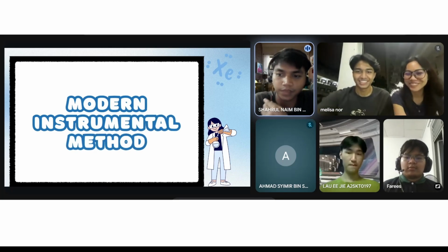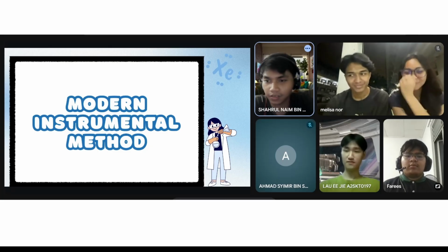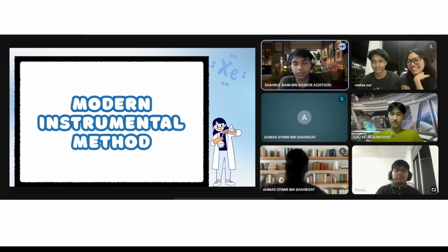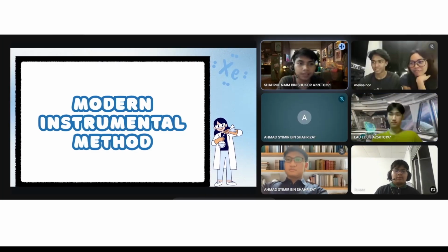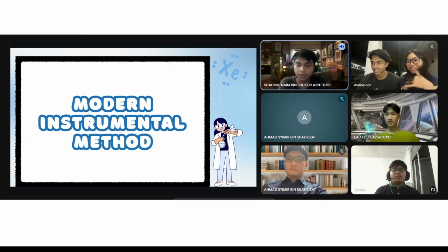Alright. Thank you Adam for your insightful explanation for the classical method. However, in our discussion, there will also be the modern instrumental method, which is a more advanced method used in biorefineries, HPLC, which is high performance liquid chromatography. HPLC can automatically separate, identify, and also quantify the glucose present in the fermentation broth.